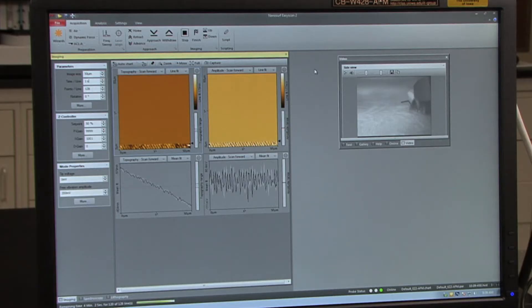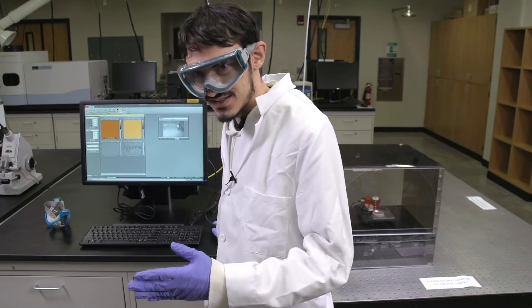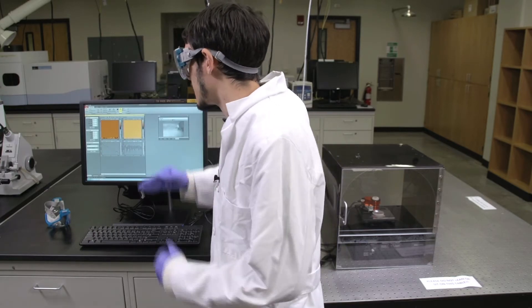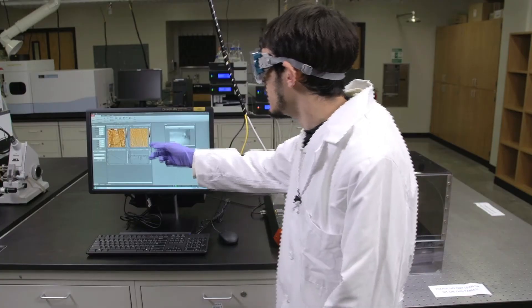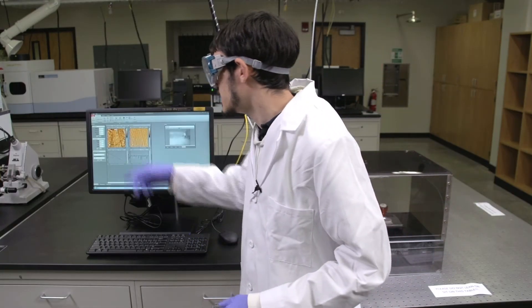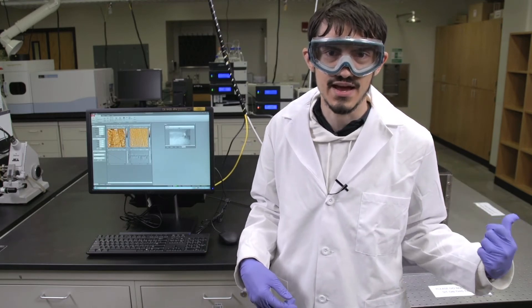Once you are sure that the image looks satisfactory, be sure to click finish, not stop, in order to make sure that it does a complete scan and does not simply continue scanning extra images after this particular scan. Unlike the current image here, what you'll be looking for are repeating white patterns on the image itself. If you do not see these, you'll need to reposition the slide under the AFM head.